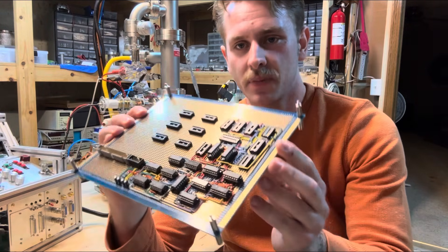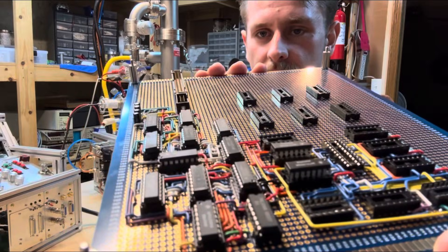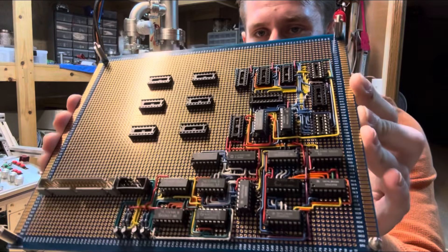So this right here handles all the scan positioning and that stuff. It's not complete yet. As you can see, I got really meticulous with the wiring like that. That's just how I am. It's the only way to do it for me.